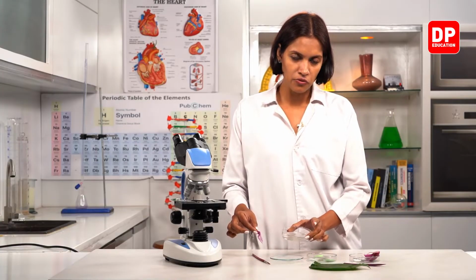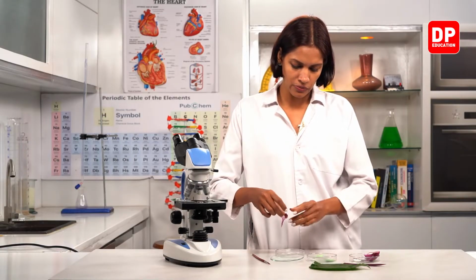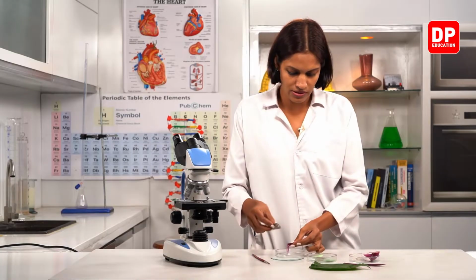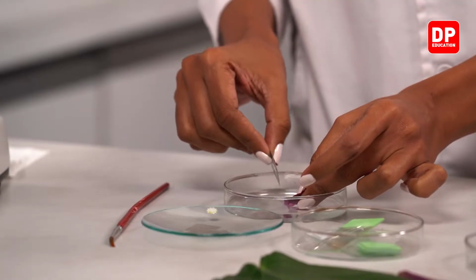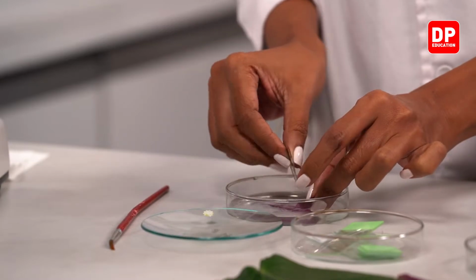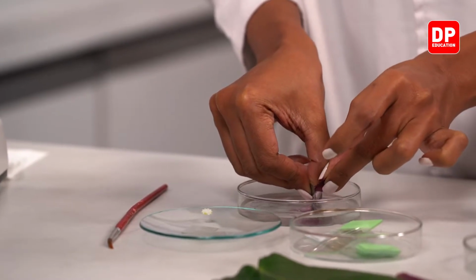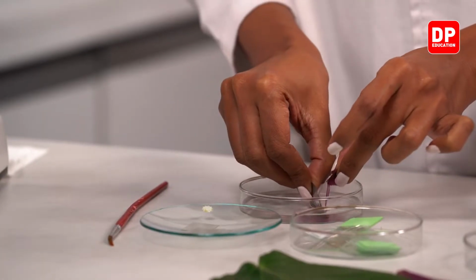So here I have some water in a petri dish. Therefore, I'm going to put this onion peel into this petri dish, so the cells will not dry off.